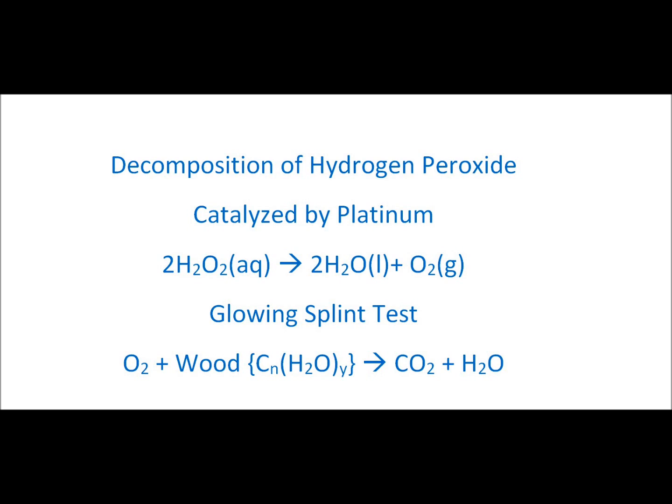I'm going to take 6% hydrogen peroxide, put 25 milliliters of it in a graduated cylinder, and add the platinum, which will cause the hydrogen peroxide to decompose into water and oxygen.